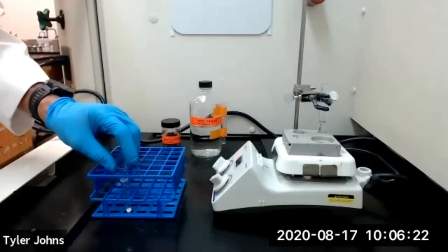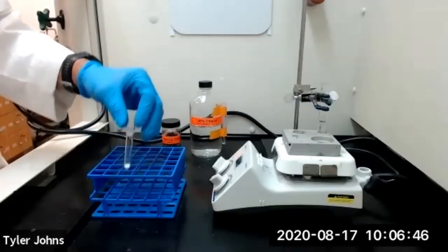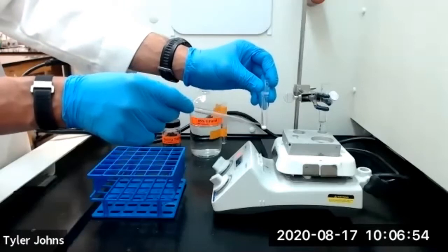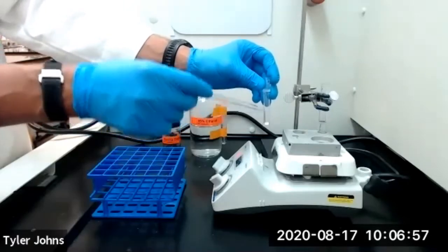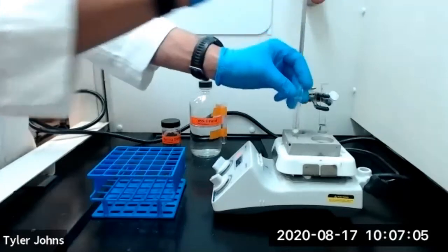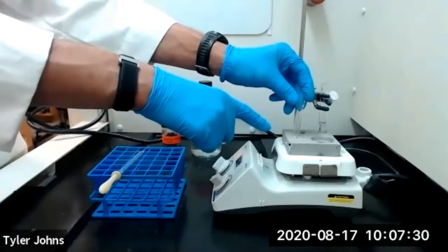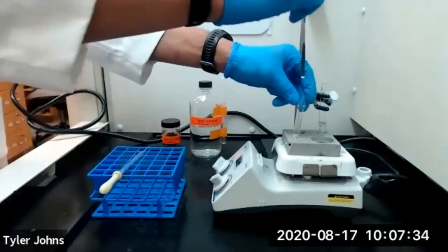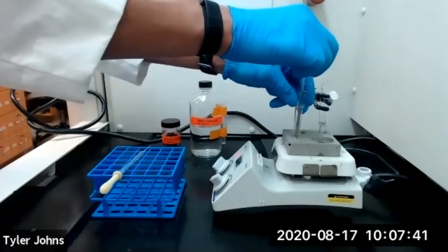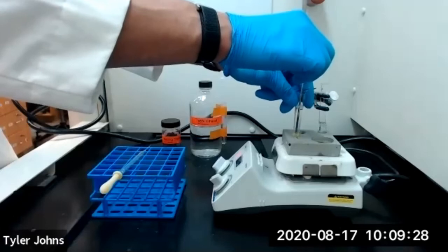Now that our 95% ethanol is boiling, we can begin dissolving our impure sulfanilamide in our Craig tube using the boiling hot solvent. First, add two to three drops of the boiling hot solvent to the impure sulfanilamide in the Craig tube before placing it on the aluminum block. Bring the solvent to boiling in the Craig tube and stir using a micro spatula for 10 to 15 seconds.